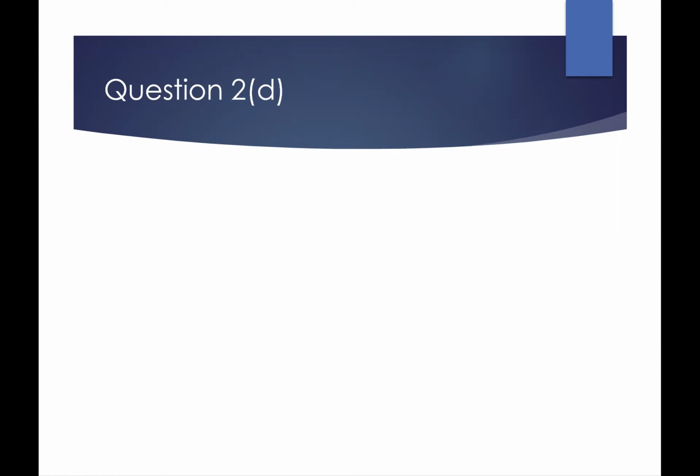And finally, the last part here in substance S, the other anion is none other than chloride ion because there is a white precipitate in test 5.